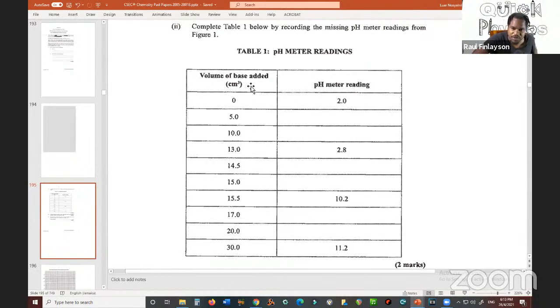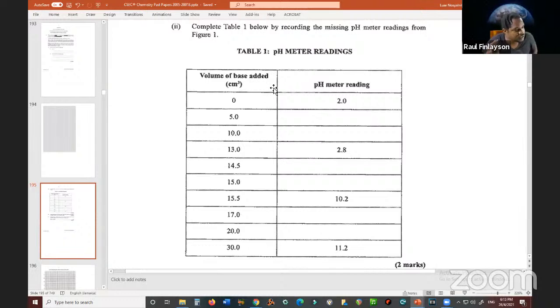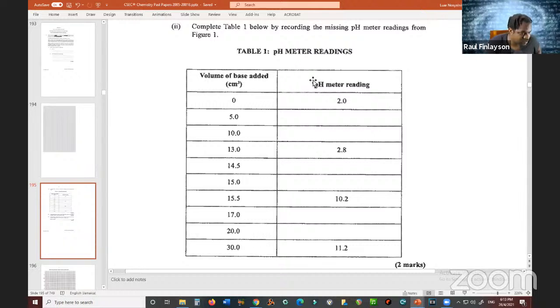All right. So get used to this as well, guys. With every titration, there's a table. Prepare yourself, guys, for every titration. There's a table. What does the table have in it? Why do we need a table? To track the volume of base added, or the volume of one thing that we add to another. Pretty much this.